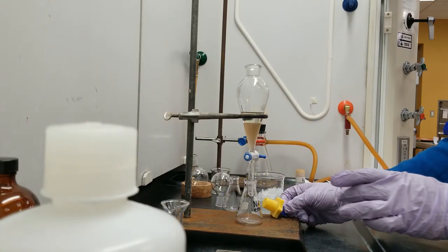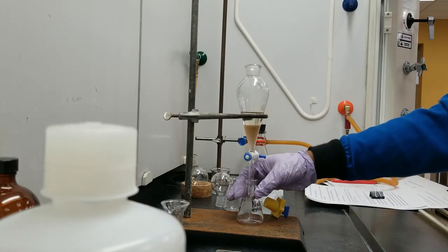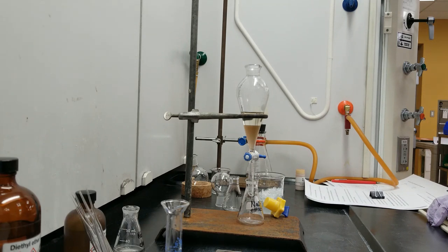Hydroxide layer into the Erlenmeyer flask labeled as NaOH extract. By doing this, we are actually forming the sodium salt of 2-naphthol, which is now soluble in water. So the aqueous layer, or the sodium hydroxide layer, contains the sodium salt of 2-naphthol.